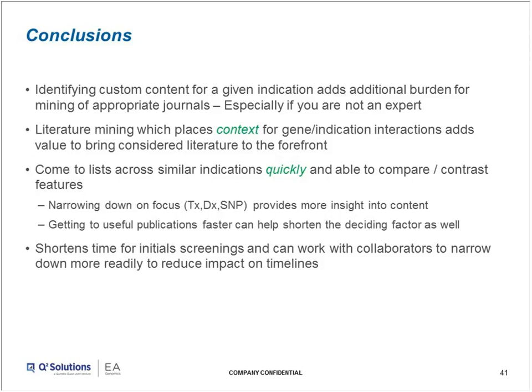So from that, to wrap it up to allow some time for questions, we are able to identify custom content. I'm not an expert in AML, not at all. I'm a solid tumor guy. But this was very encouraging for me, in just a short couple minutes of an afternoon, to pull out hundreds of individual protein changes or markers that I might be able to add. So that was awesome.